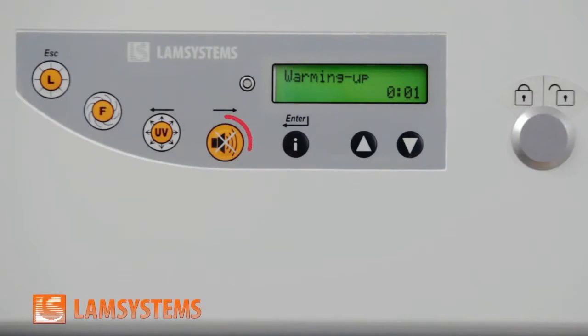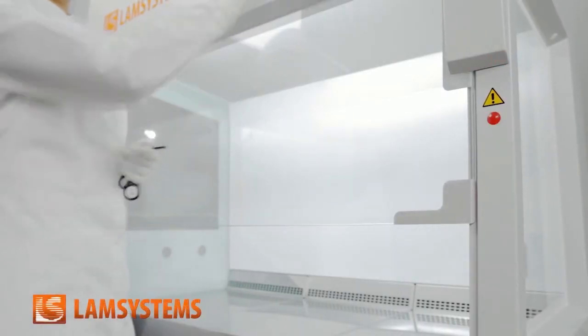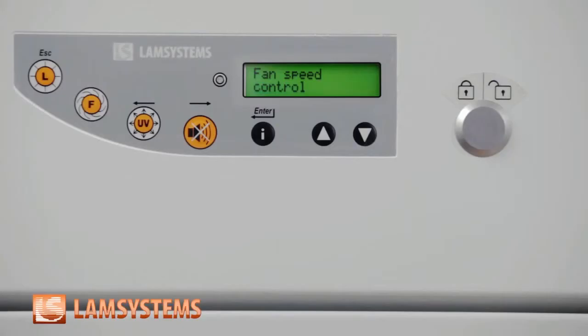You can turn off the sound to avoid discomfort. The flashing red light warns the operator that it is impossible to start work until all cabinet characteristics reach the specified parameters. When the cabinet is ready for the operating mode, the light turns green and you can start work.